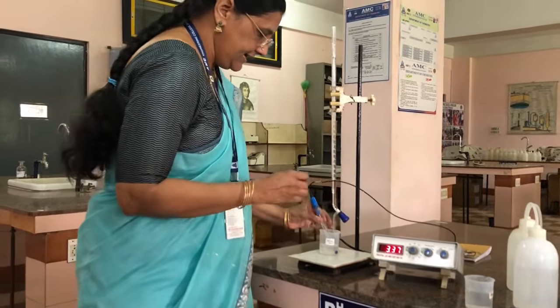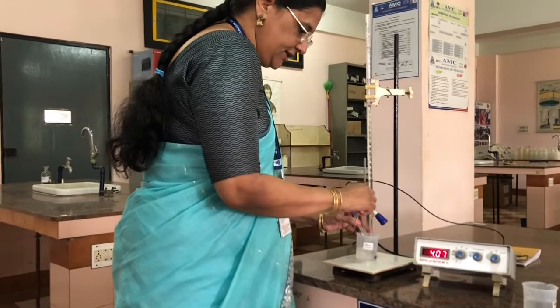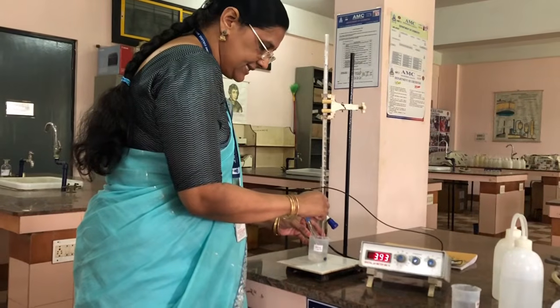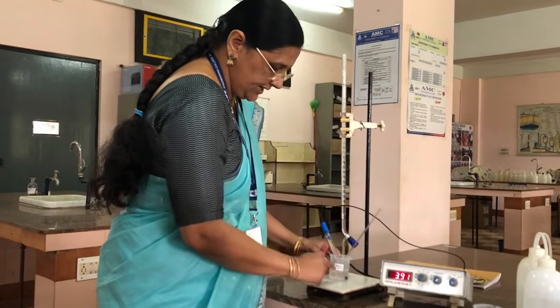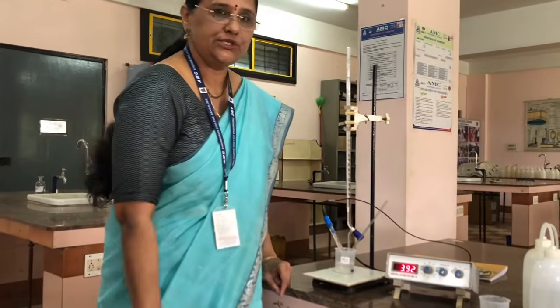And after adding that, we have to shake the solution. When you shake the solution, the neutralization reaction occurs between the base and the acid. So the H plus ions which are present here get neutralized by the base. The H plus ion concentration is decreasing, which means the pH of the solution increases.